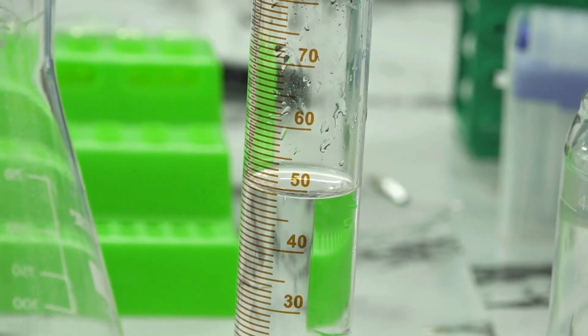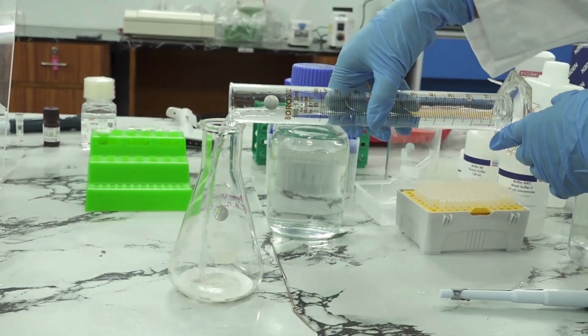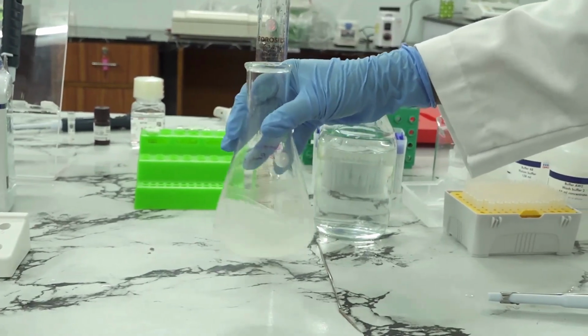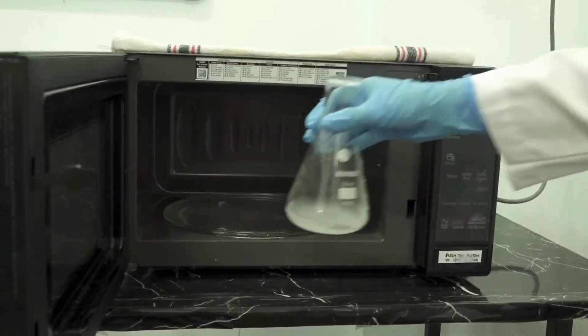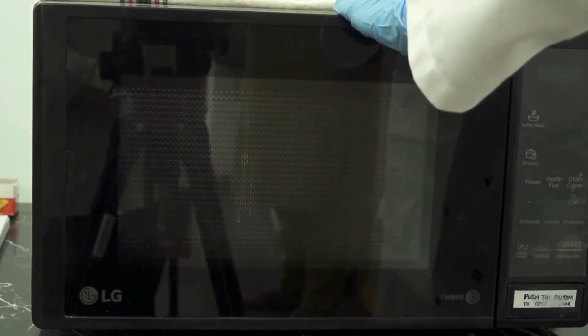Mix agarose powder with 100 milliliters of 1x TAE in a microwavable flask. Microwave for 1 to 3 minutes until the agarose is completely dissolved.